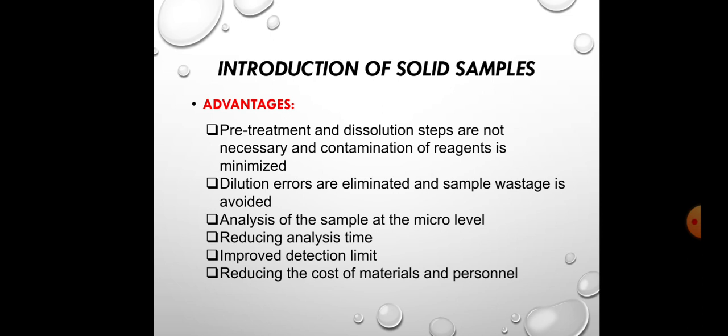Here you can see that the introduction of solid samples has several advantages. For example, the pre-treatment and dissolution steps are not necessary in this case, and contamination of reagents is minimized. Dilution errors are eliminated and sample wastage is avoided.